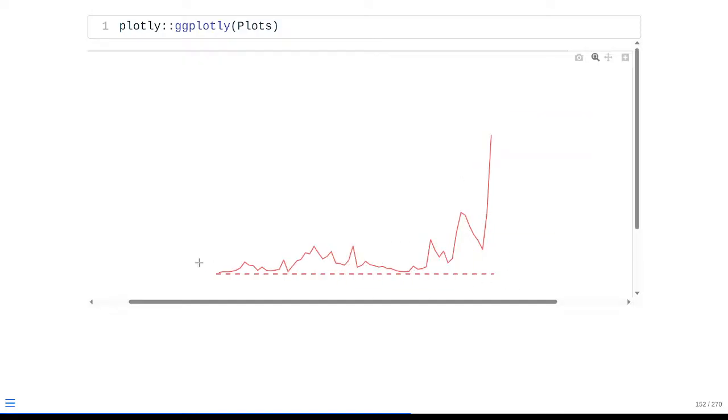So this is a pre-processed signature. We haven't subtracted out background. Hopefully when we subtract out our negative background, a bunch of this little extra bit of noise will be eliminated, leaving us with just the actual fluorophore contribution to the signature.